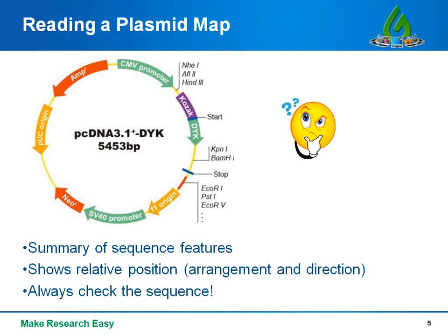And, caveat emptor, plasmids are often shared and repurposed without sequencing the entire backbone, which means mutations can accumulate. Those may or may not impact your experiment, but just be warned, if you get two clones from two different sources, even if they both say that they use a pcDNA 3.1 backbone, they may in fact have slight differences in the sequence that won't be apparent from the map alone.